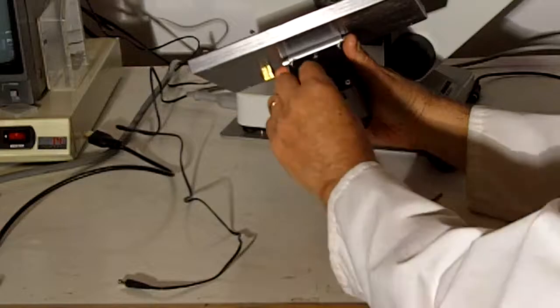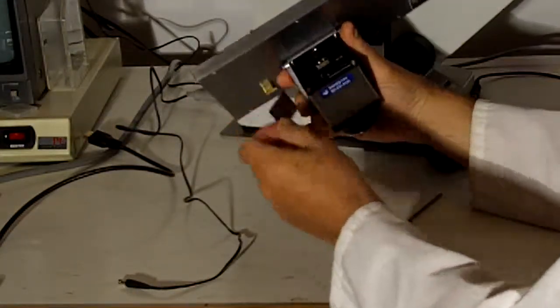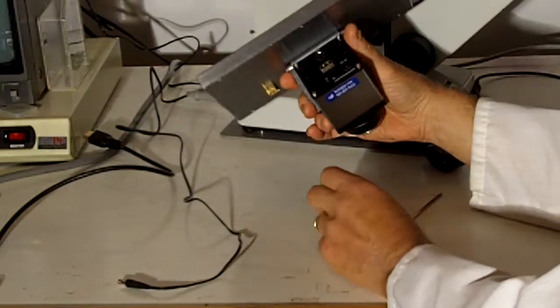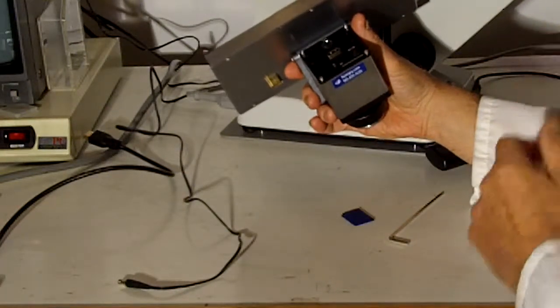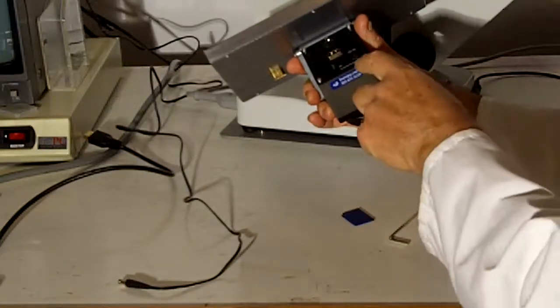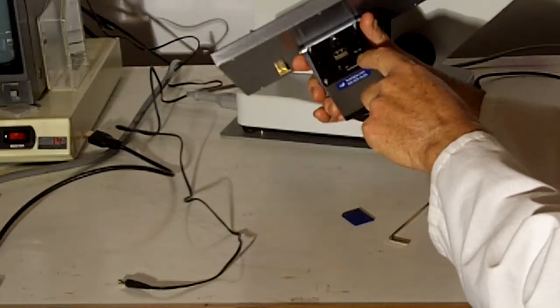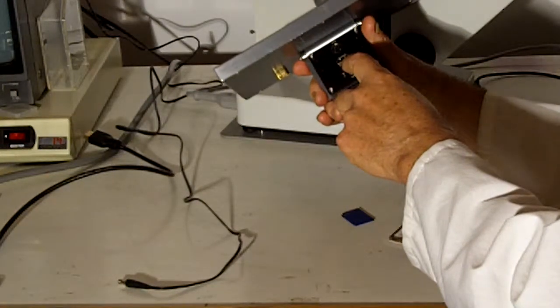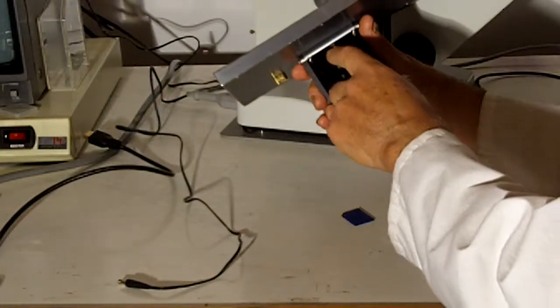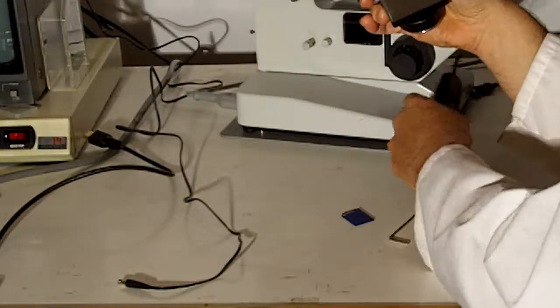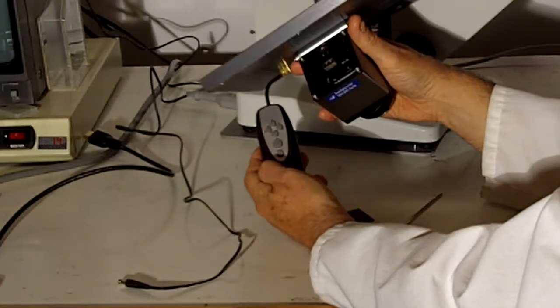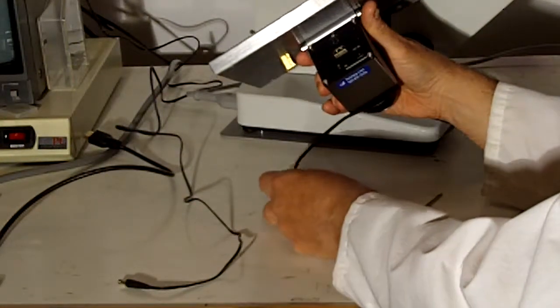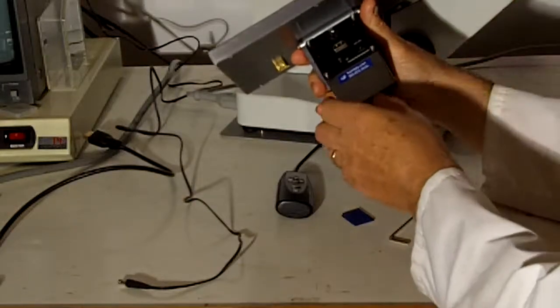On the back of the camera, there's an SD card slot that comes with a 4 gigabyte SD card when you buy the unit. There's an input for a 12-volt DC power supply, an on-off light, an HDMI connector, and a connector for the remote camera control and shutter release for photomicroscopy.